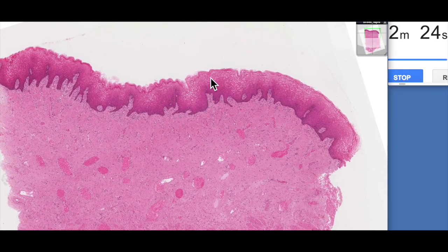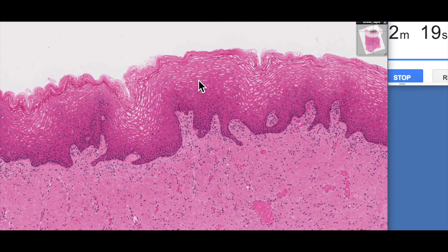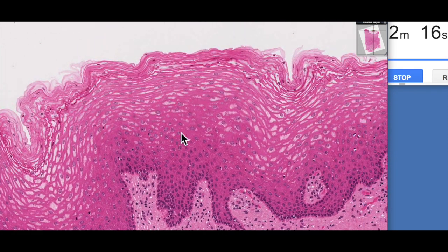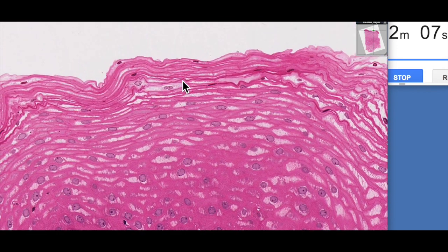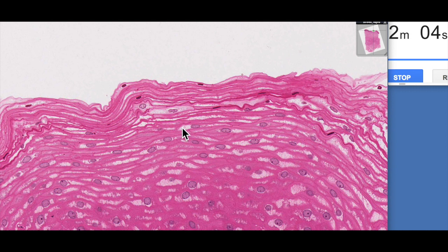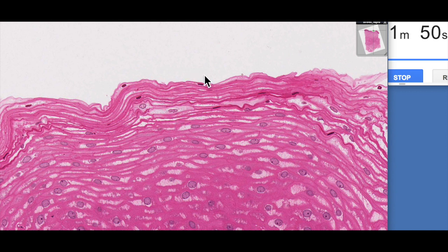The surface epithelium after puberty of the vagina has some unique characteristics. One of these is that the surface epithelial cells actually store and then release glycogen. Now glycogen is an inert substance, so it doesn't stain with hematoxylin and eosin, and therefore appears as unstained regions within these cells. This glycogen is released and housed within the vagina is a native flora of lactobacillus bacteria.